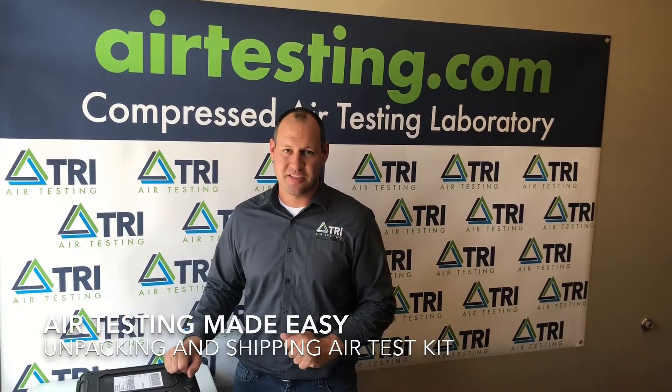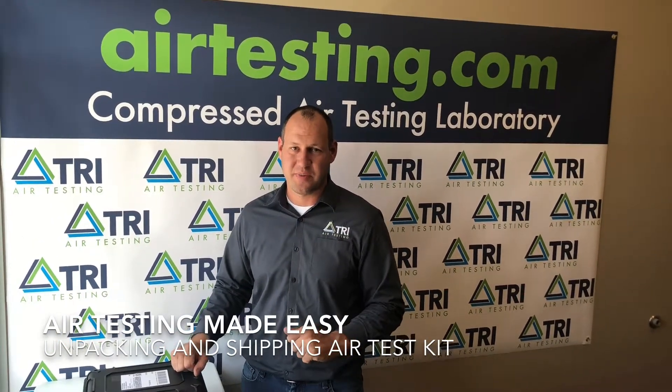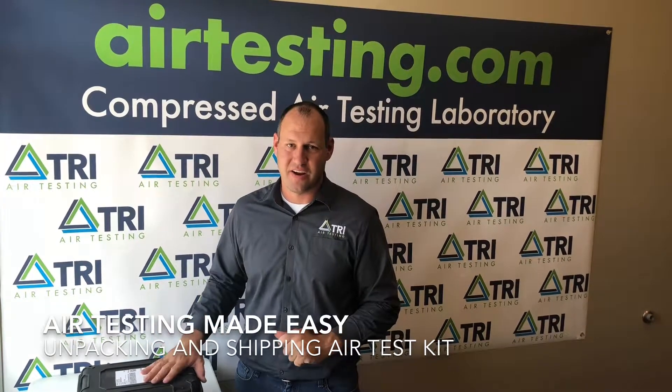Hey everybody, today's edition of Air Testing Made Easy — we're going to discuss packing and repacking your TRI air test kit.